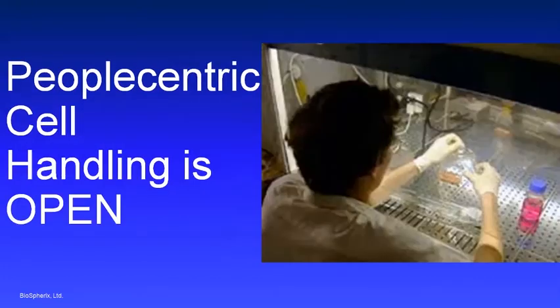Now, when cells need to be handled, you need to change the medium, you need to do your regular cell passaging, the environment's even worse for them. This is an even more people-centric environment for cells. It's easy for people to put their hands into a biological safety cabinet. It's easy to handle the cells there, but the risk of contamination is highest there for the cells when you think of it from the cell's point of view. Not only are they hyperoxic, and hypocapnic, there's not enough CO2 there, but now they're freezing. This is a cold environment for cells, and it's very stressful.